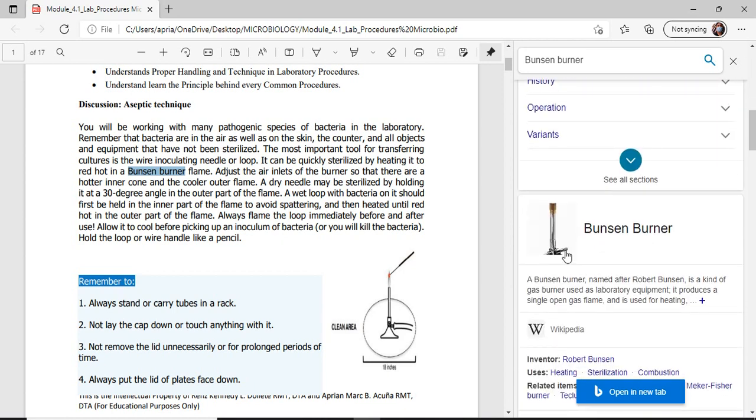Makita nyo nito sa dilang side, this is your valve or regulator sa aton flow sang gas, so that there are hotter aton nga inner cone and cooler sa outer flame. Ibig sabihin, kung mag-flame ka sa babaw sang aton nga inner cone kagat sa tunga sang outer nga flame.